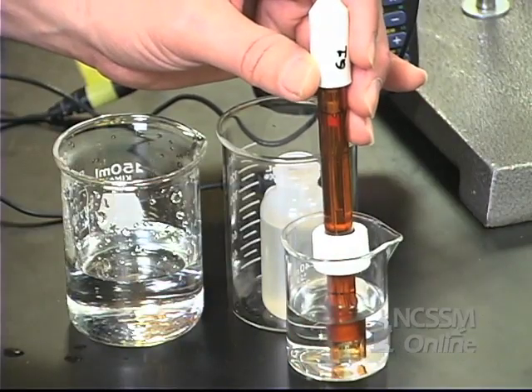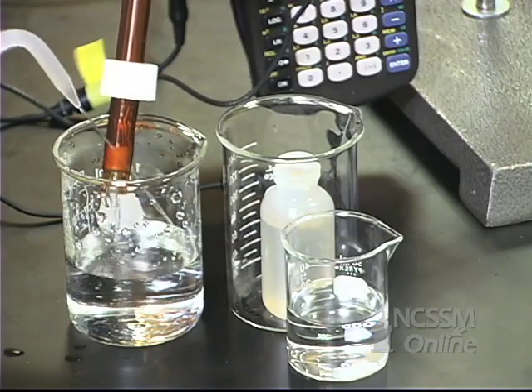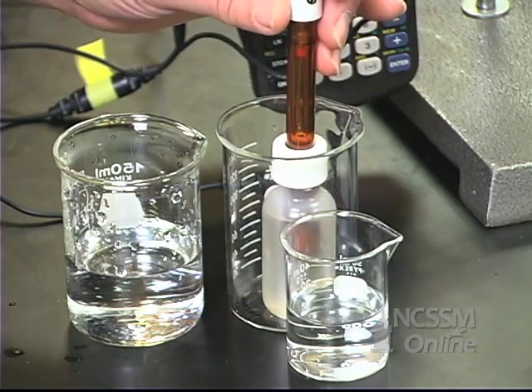We're going to remove the probe from the solution, rinse it with distilled water, and put it back in our storage solution.